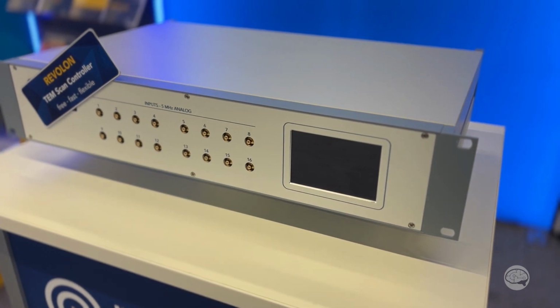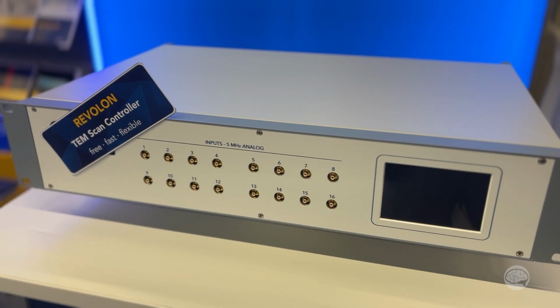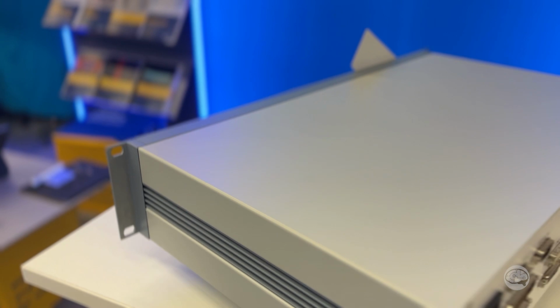We're still in the Mega booth and I'm with Matthias from Pointelectronic, and you have a new piece of equipment in your booth this year that sounds really interesting for TEM. Can you tell us about it? Yes, it's a TEM scan controller.